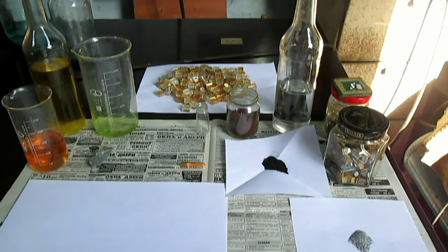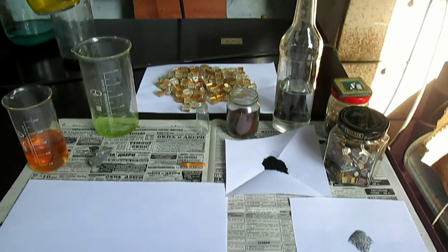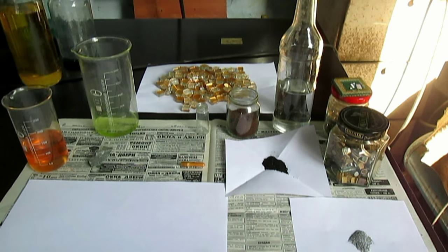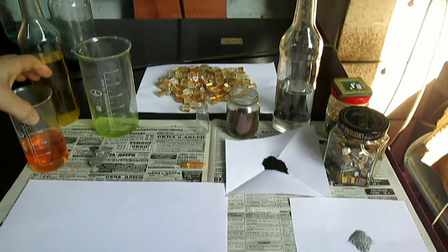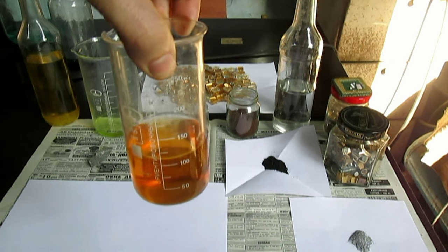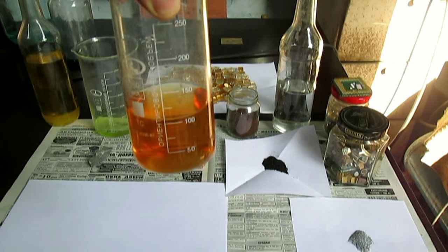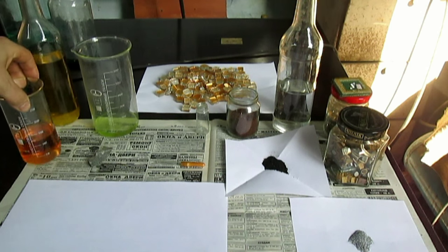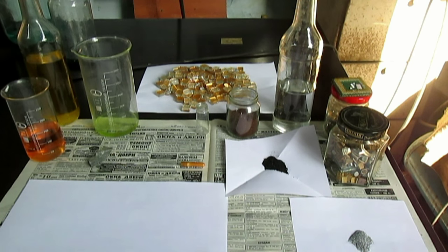Также на столе находятся растворы с золотом. К примеру, стандартный царско-водочный раствор с золотом. А вот раствор с золотом — я заранее растворил золото, осадок с золотом в суперреагенте. Видите такой немного бордовый цвет — или точнее морковный какой-то.